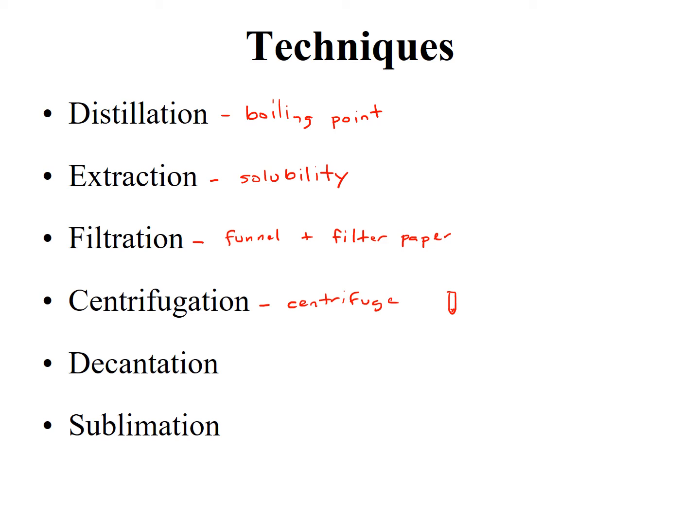Now, what you're going to do to separate your water soluble and water insoluble components in this experiment is decantation. This is just very careful pouring of the liquid component of a mixture to achieve separation from the settled solid. You just allow them time to settle down, and then you pour. You remove the liquid component, leaving the solid component.